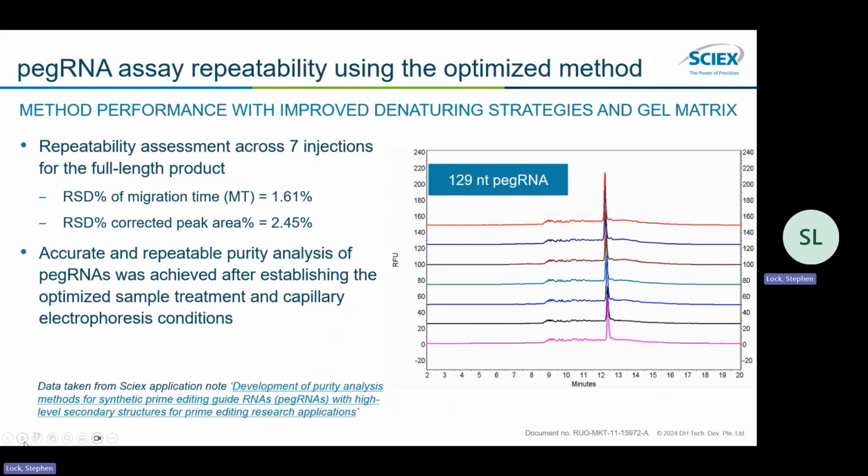One of the things you can do in order to speed up this type of separation as well is change the gel buffer, and that's something we also play with sometimes in separation. So you can use TBE to dilute the gel buffer to increase the speed.